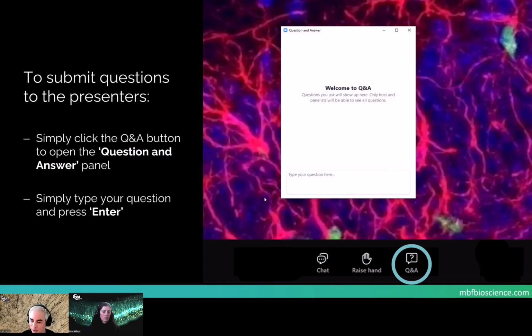And the beauty here is, if you want to change parameters, like the detection method, for example, you click on one of the top boxes. Just think about these as kind of hierarchical: you have your project, and then you have your sections, and then you have your regions.